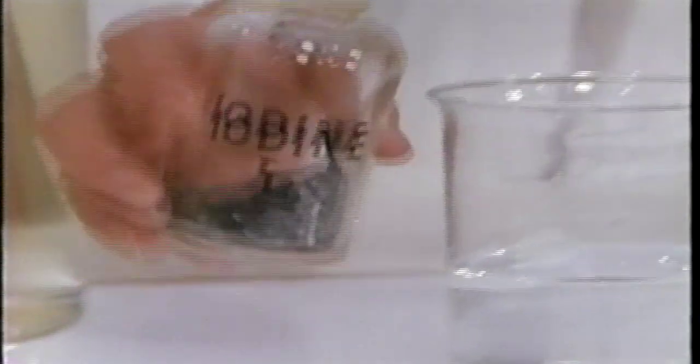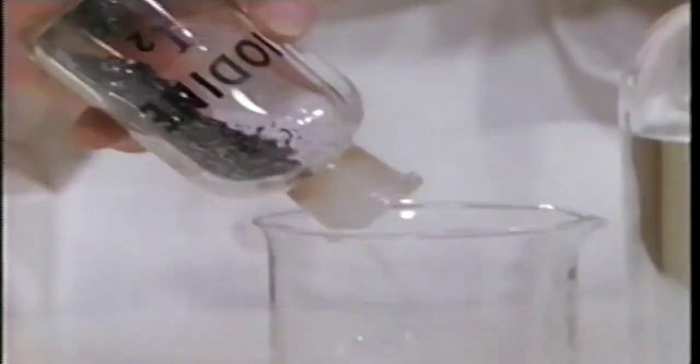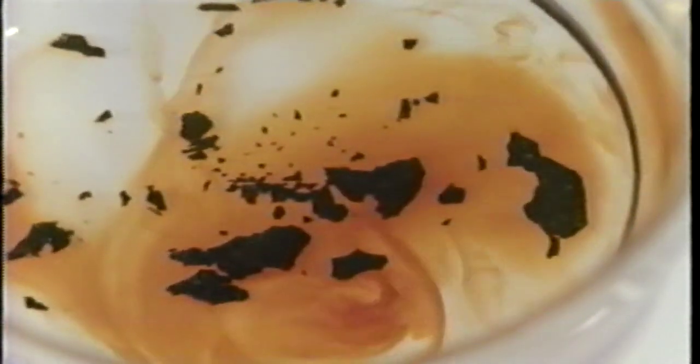Another solubility experiment: solid iodine dissolving in a mixture of ethanol and water. The color change shows that iodine molecules are leaving the crystal to become part of the liquid, forming a solution. As more iodine dissolves, the color intensifies. But after a few minutes, the color stops changing, though solid iodine remains. Apparently, the concentration is now constant. Again, we have reached solubility equilibrium.